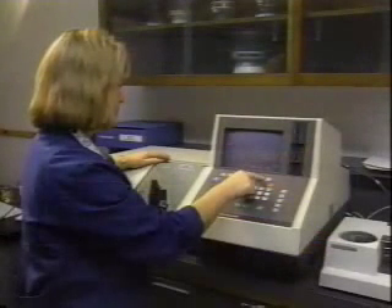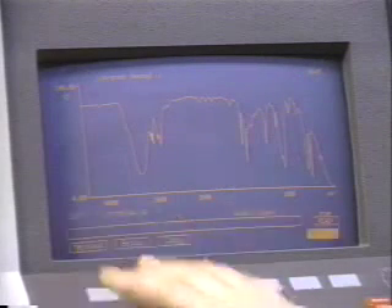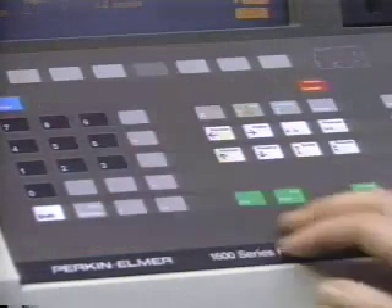We have only touched on the numerous functions of the FTIR spectrometer. The FTIR is one of the most useful tools available to the organic chemist. Hopefully, you'll be able to run your own IR spectra throughout your second semester of organic chemistry.